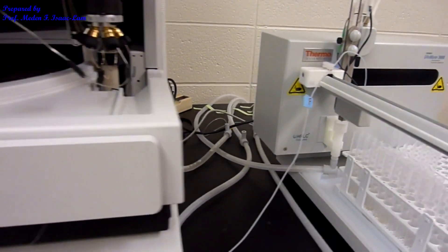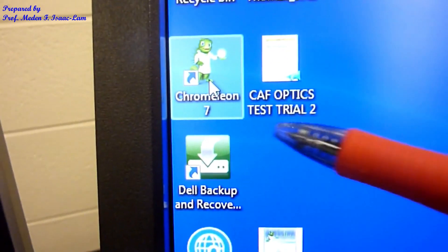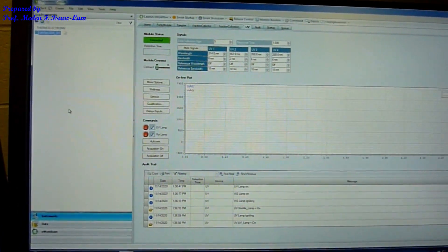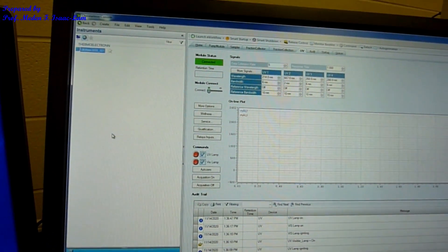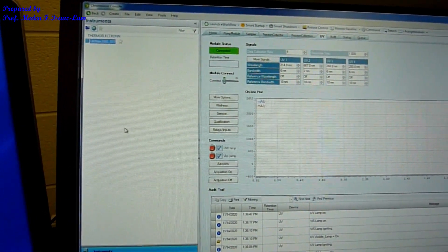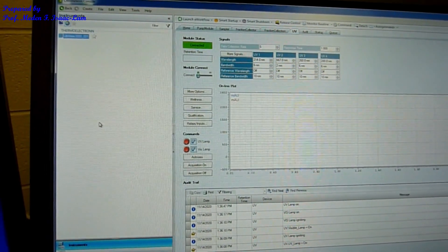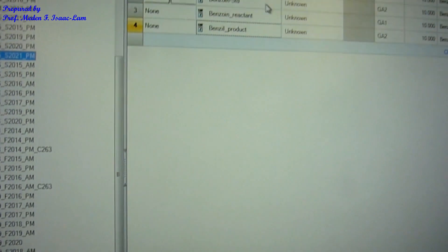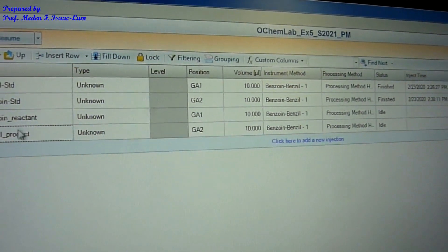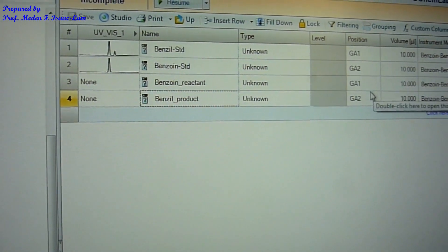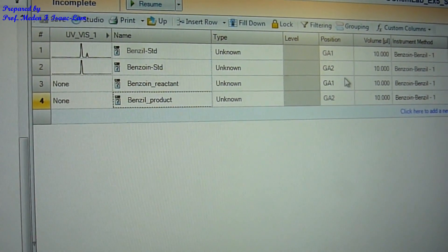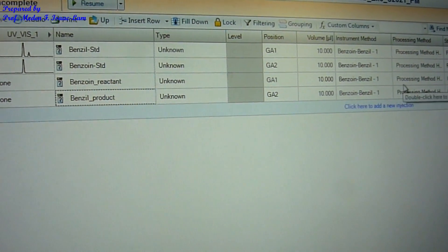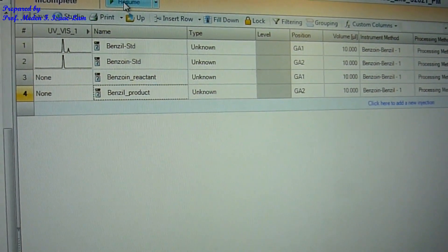This instrument is controlled by software called Chromeleon 7. Once you click it, it will show the interface where you can program whatever mixture you want. There are many parameters to set up and optimize the conditions for the HPLC. I already set up the run — this is for OCAM Lab, experiment 5 — and I'm now going to run the reactant. The sample is placed on green A1. I already set up the method, and we are now going to click resume to run.